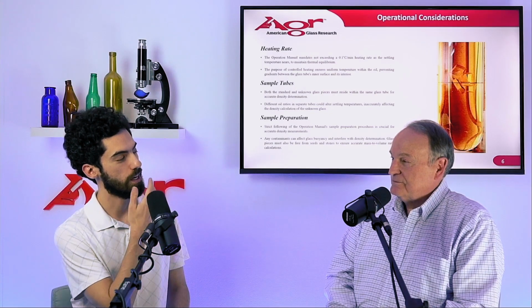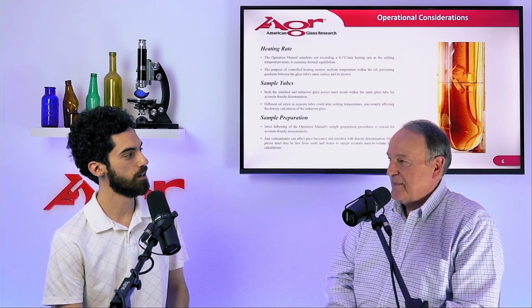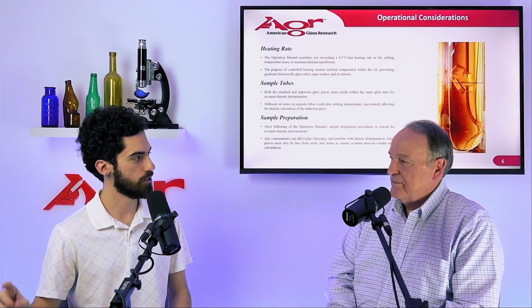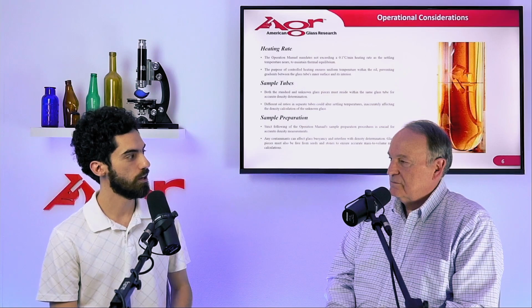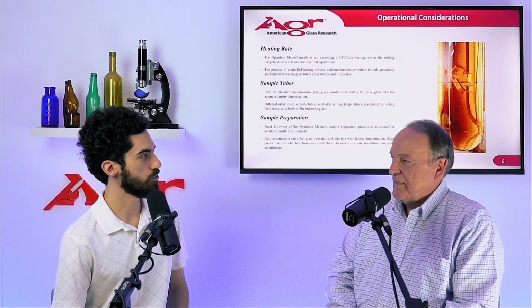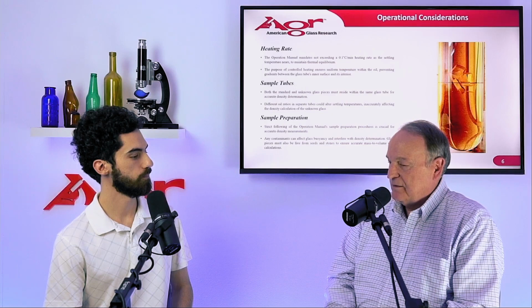Yes. And then you can go back and, okay, so I see how you mentioned earlier how this has relation to cord. This is what you were talking about. Yes. Yeah. Not necessarily that we're testing one sample and we can measure the differences in cord. We have to measure several samples that are randomly selected. And if they are falling at different rates, assuming it's the same furnace draw and all that, then we have a cord issue. Yeah, there's something wrong.